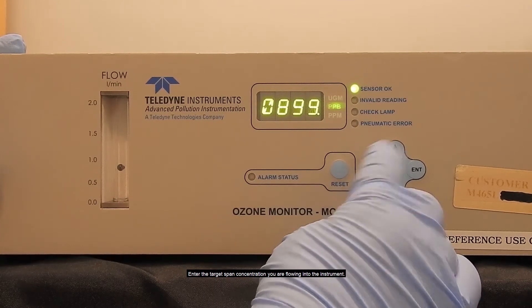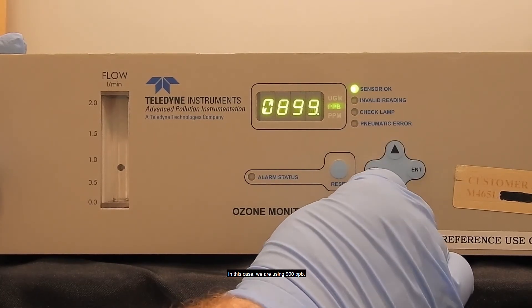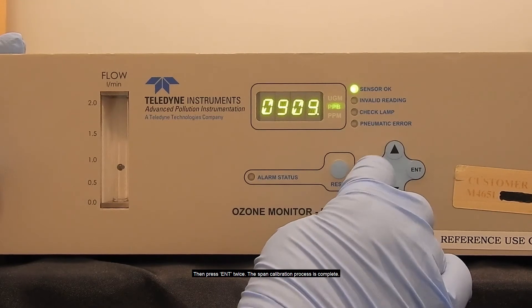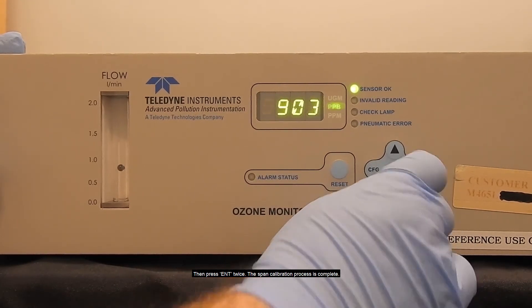Enter the target span concentration you are flowing into the instrument. In this case, we are using 900 ppb. Then press enter twice. The span calibration process is complete.